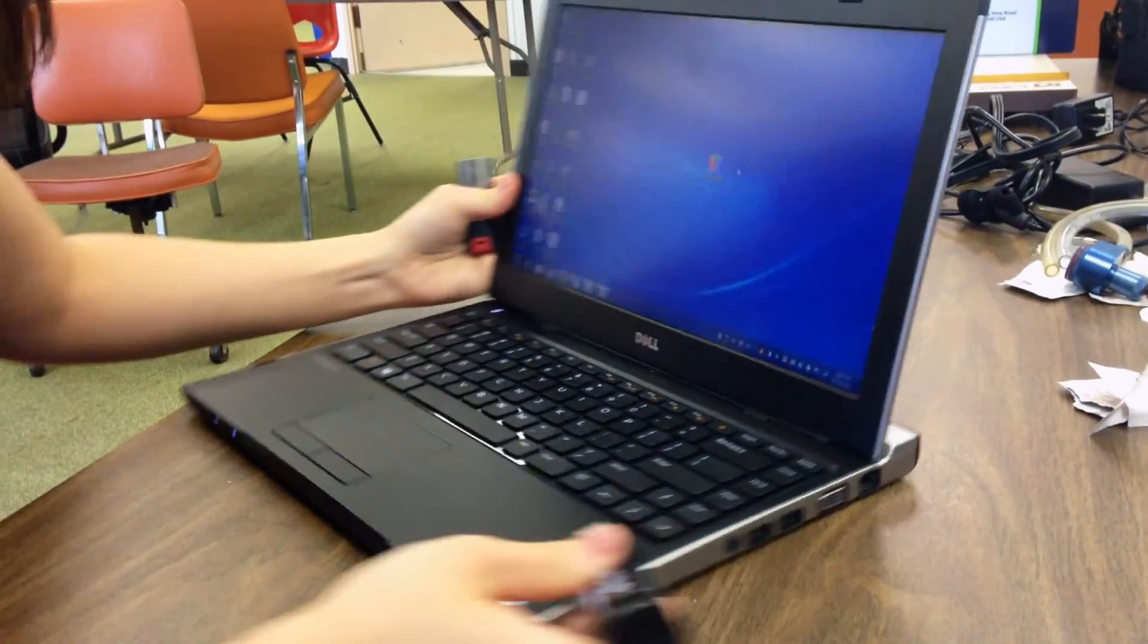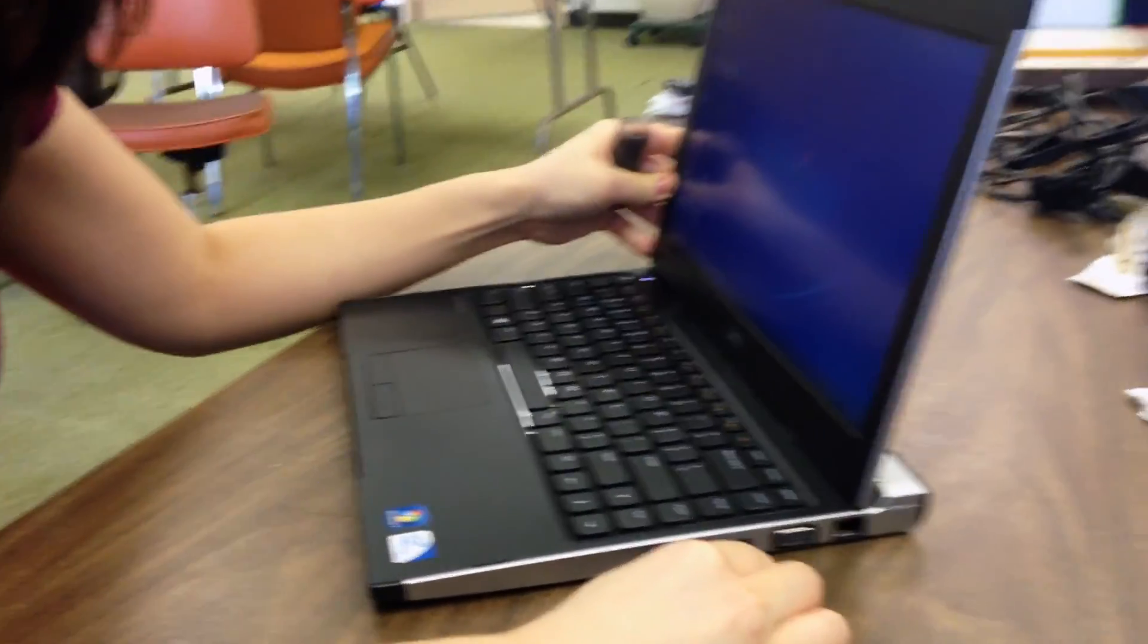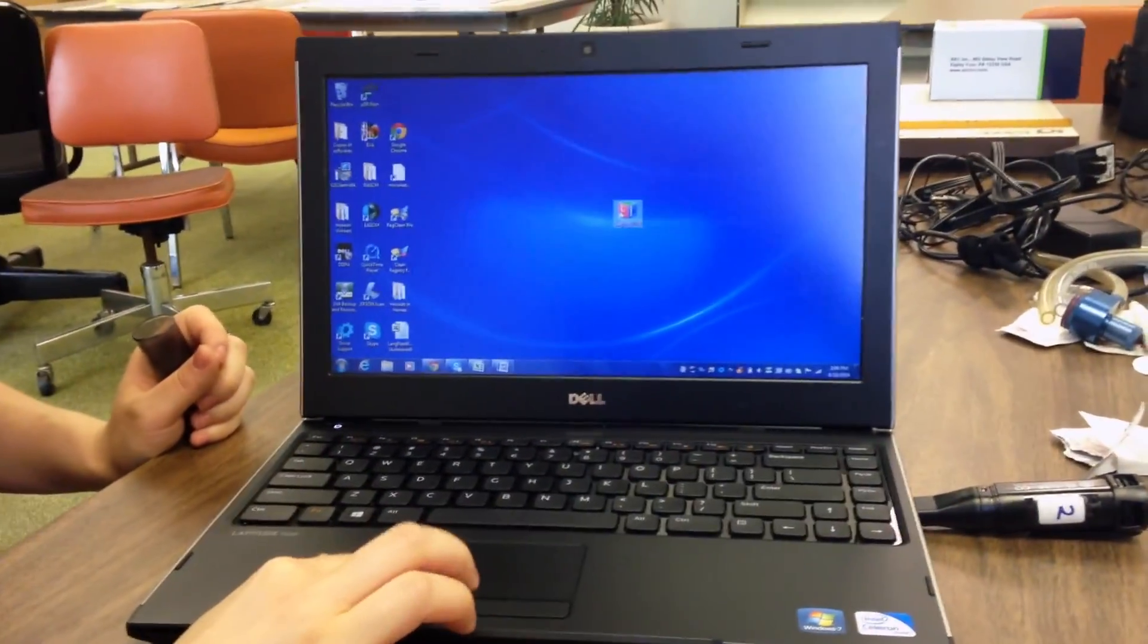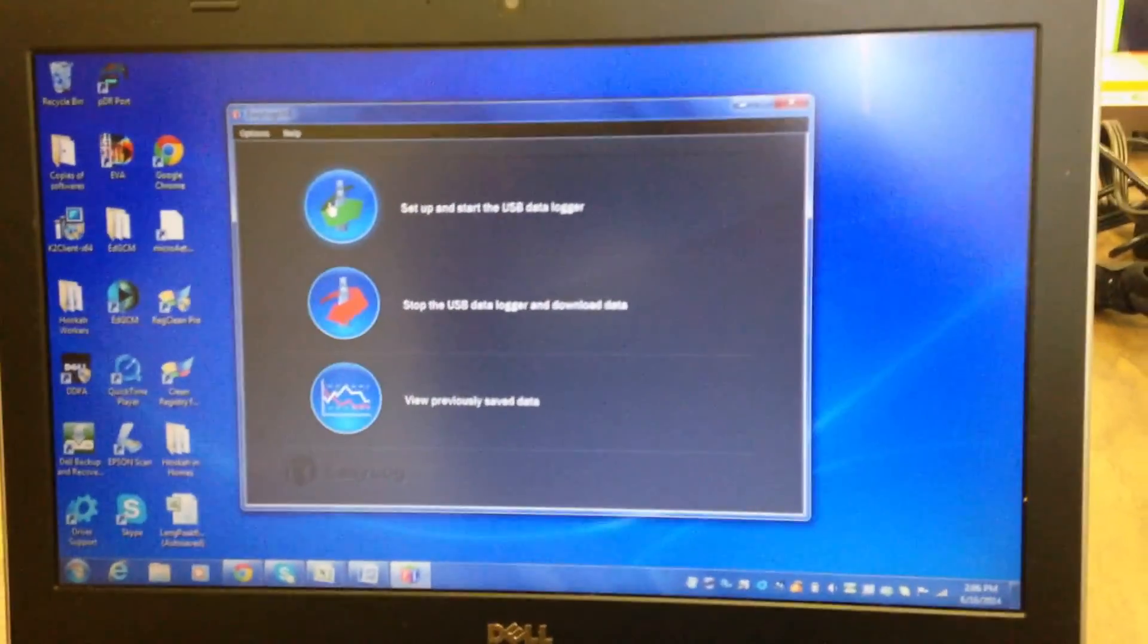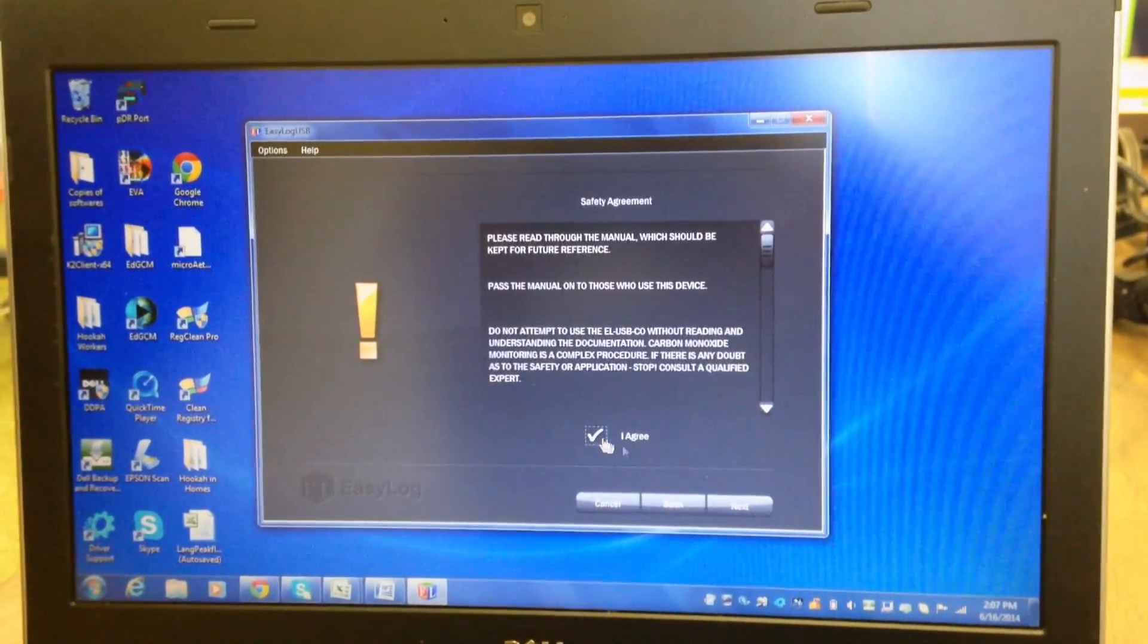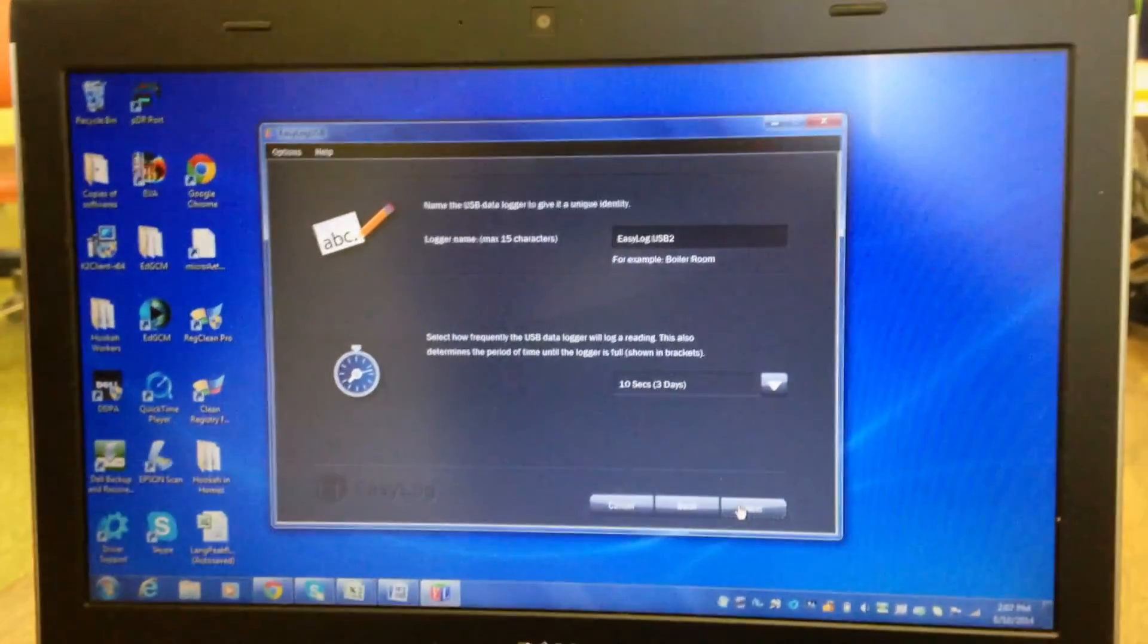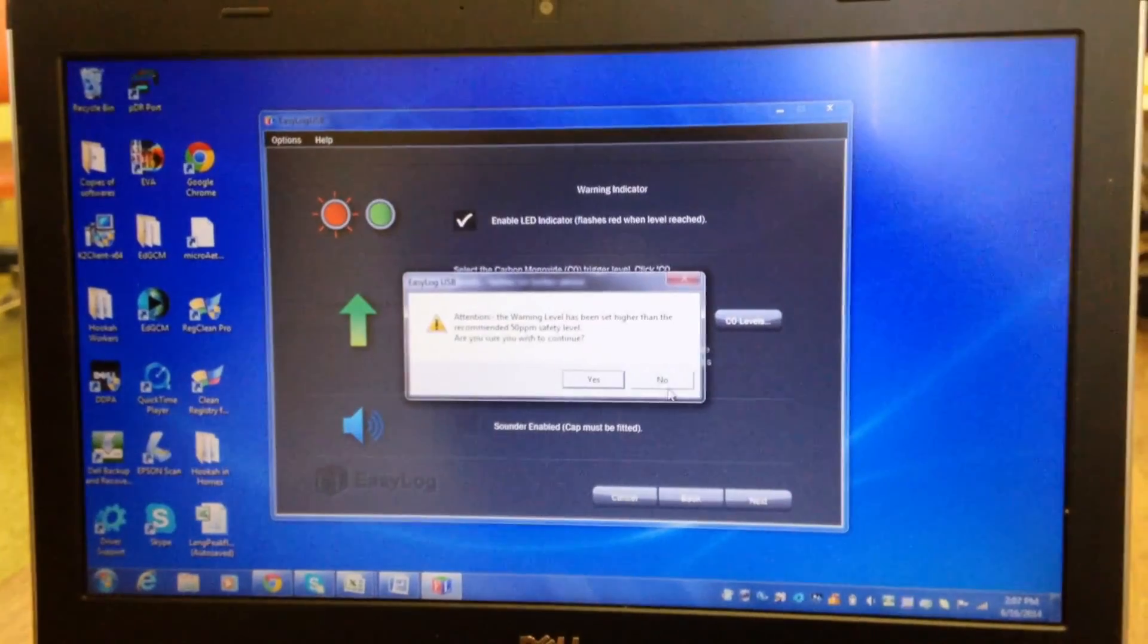In order to start your CO data logger, first remove the cap, then insert the monitor into the USB port of your computer. Use the logger software to set up the instrument. It can be configured by logging time and with a delayed start to continuously measure CO levels. A green light will flash every 10 seconds to indicate that it is currently logging.